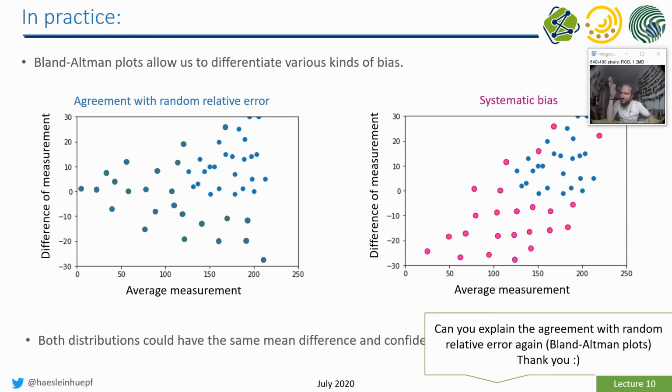Obviously these two methods are telling us the same story, but there is a random error between them. So there is some fluctuation. They do not tell us exactly the same value, because otherwise they would sit on a straight line at 0. There is some variation, and this variation depends on the intensity, the value itself.